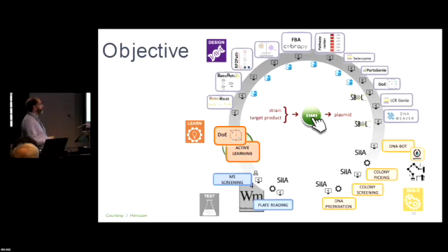So you can start just by providing your initial targets, the molecules or the family of molecules that you want to produce, and then let the system generate all of these, select the enzyme, the pathways, and generate the DNA parts combinations. And finally, run it in the robot.